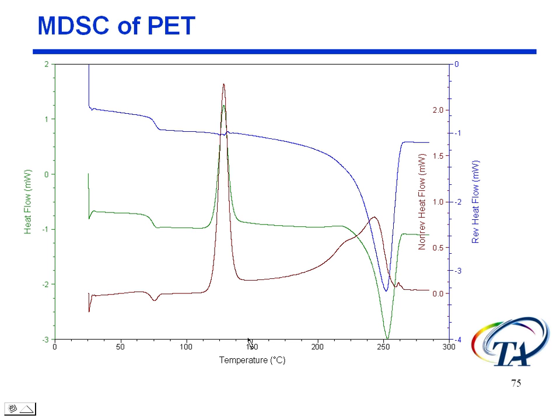Now, when I look at this, there's a couple things that I like to do to the graph, and I'm going to show you that. The reason I'm going to show you that is, 1, because I'm giving the course, so I'll show you the way I like to look at it. But 2, there are some reasons for why I do this. Now, one of the things is, if we look at the axes here, we can see that they're not all the same scale. It's not a bad idea to have it on the same scale so that you make sure you're looking at things on an even footing. But also, I don't like the way all these curves overlap in this region.